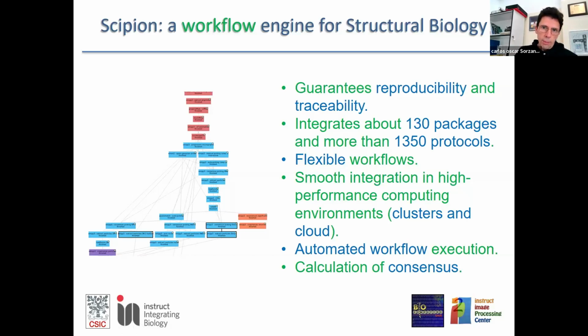And what it provides is a layer of reproducibility. So in principle, up to the random initialization of the algorithms, if you re-execute the same process and the process is deterministic, you should have exactly the same result. It provides you traceability because you know exactly which steps were performed with which parameters. You have all kinds of analysis to see what was the output of that step.